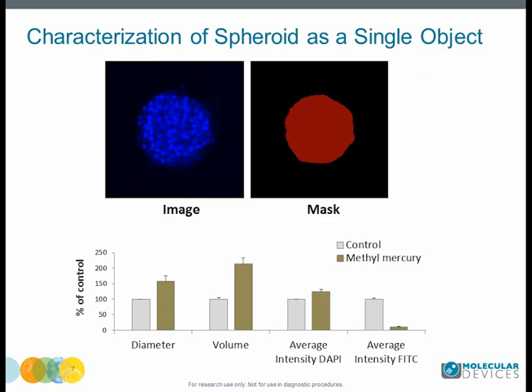In the present study, 3D analysis of images was accomplished using recently added features of MetaXpress software. The software converts a stack of 2D images obtained by confocal acquisition into 3D space with appropriate detection and segmentation of objects. Spheroids can be characterized by their size and also intensities.